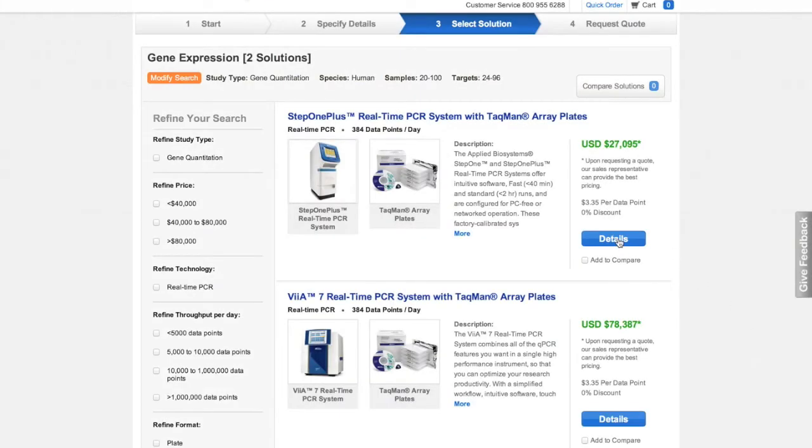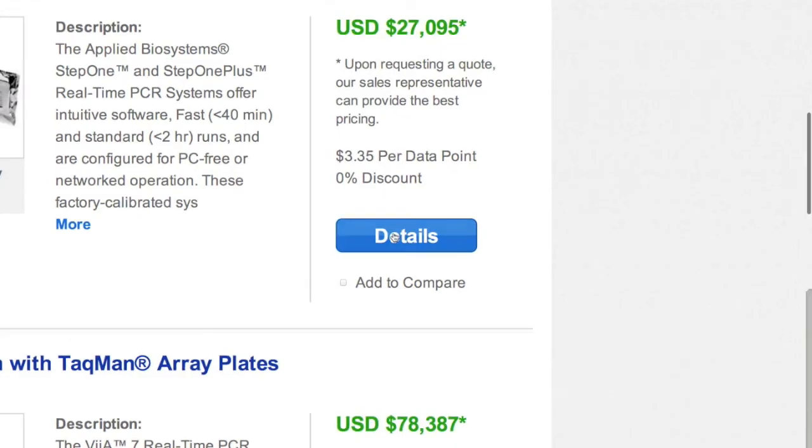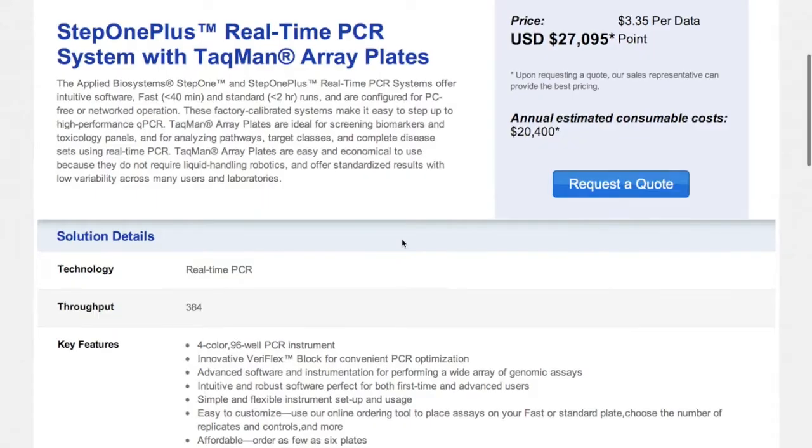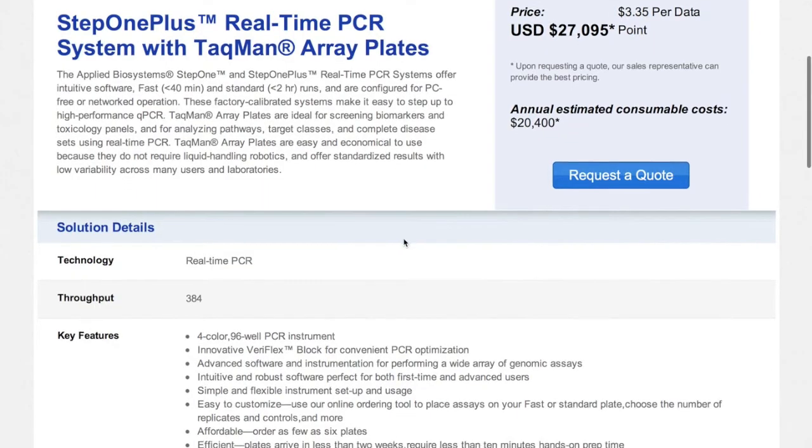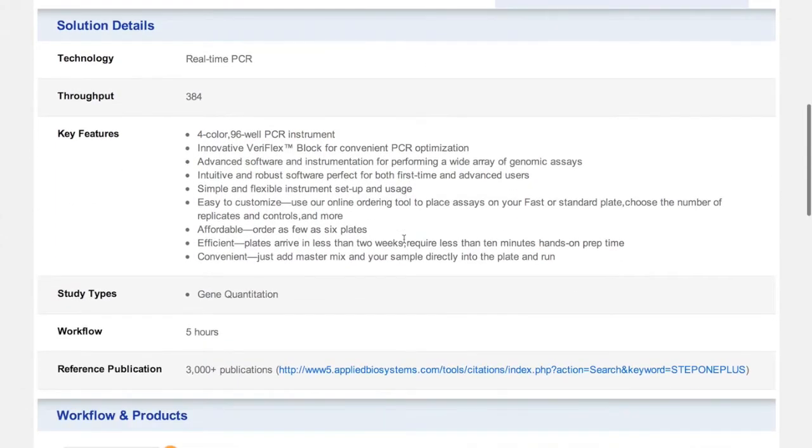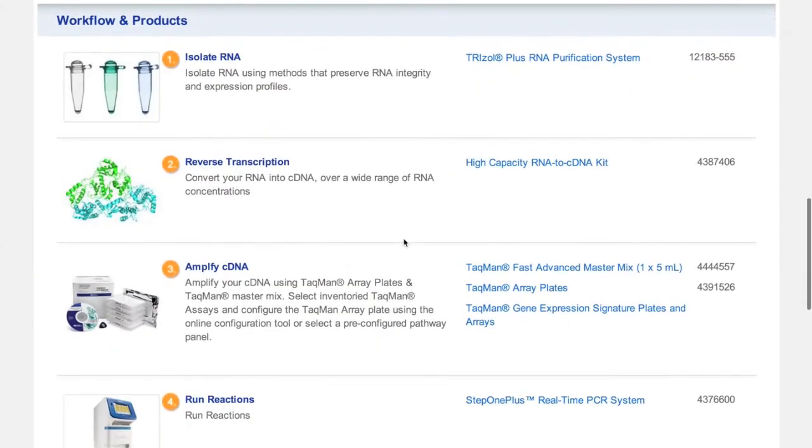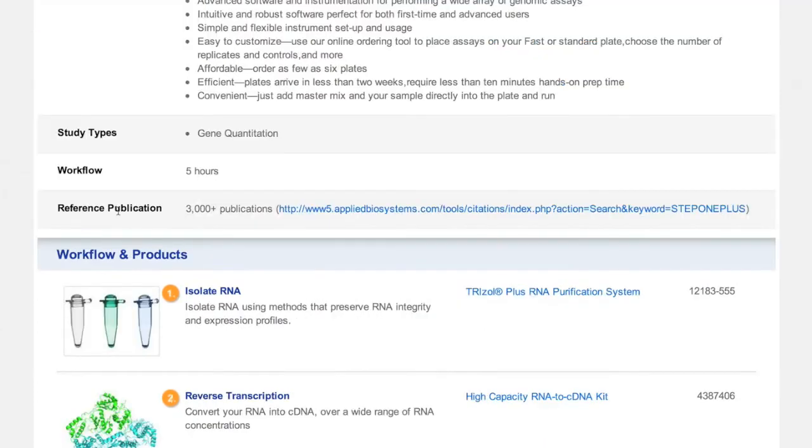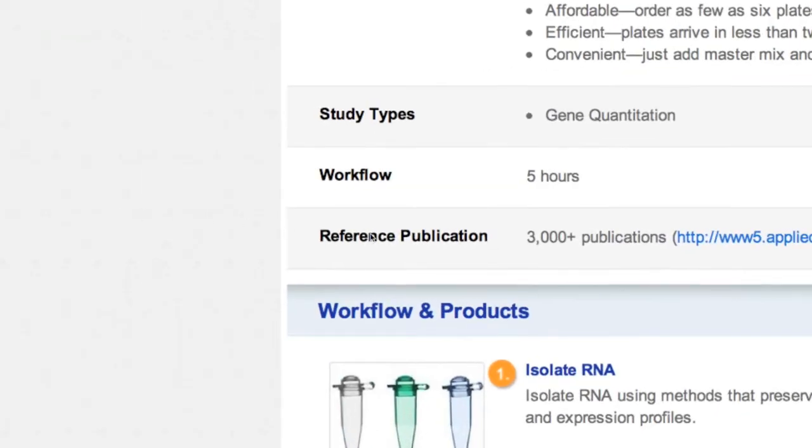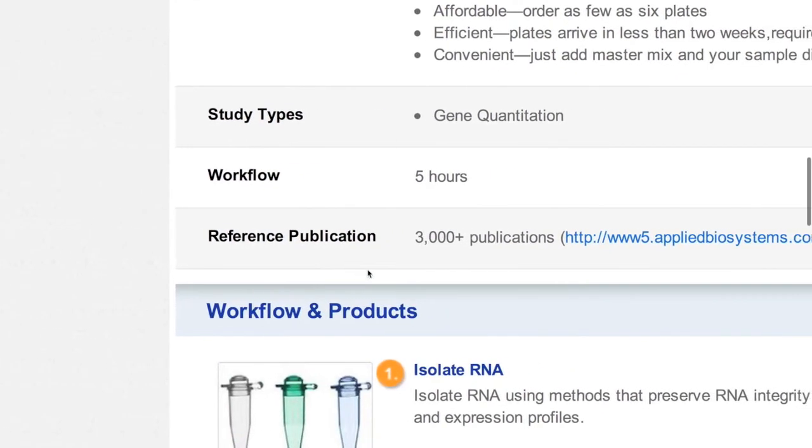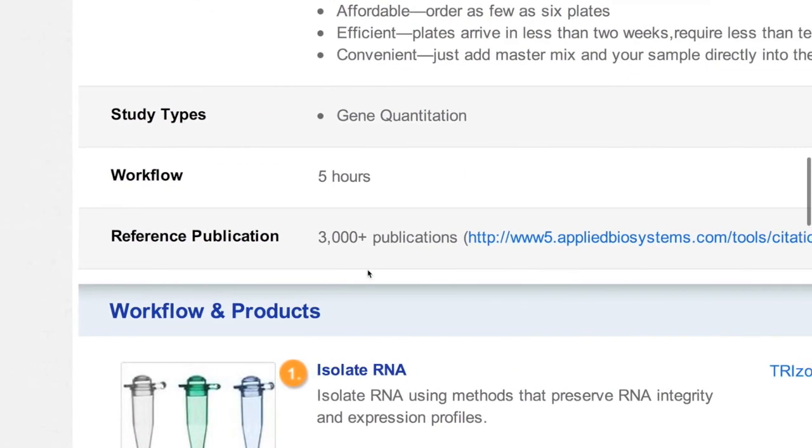Click on the detail button to get all the information you need, including specific products required for each step in the experimental workflow. You can also see reference publications using the same instrument and technology.